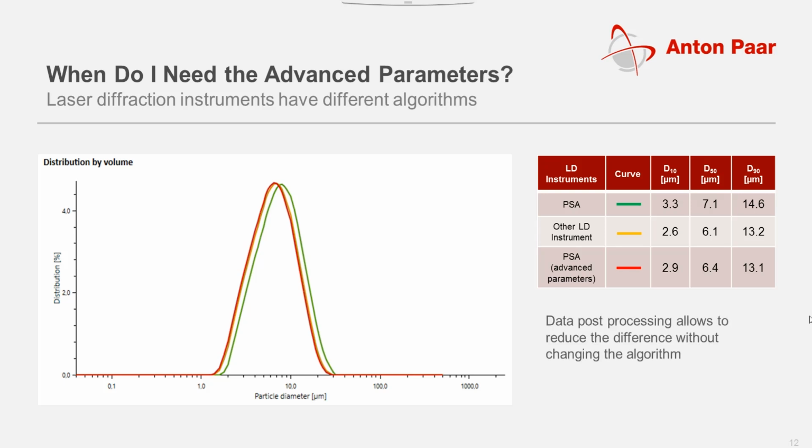By adjusting the right advanced parameters, no change within the algorithm is done. It's just a matter of data post-processing. Always remember that the basic theory of laser diffraction is the same, but each instrument works with a different algorithm.